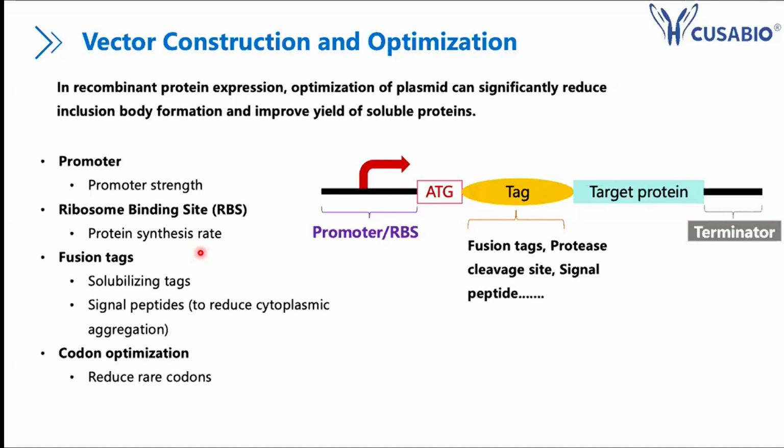And actually, these are the existing strategies for optimizing protein expression that people should choose. In this optimization, we can optimize the promoter, changing your promoter from a weaker to a stronger one. You can also do a simple codon optimization, make a smart choice of host cells, and optimize the culture conditions. All of these are included in the smart strategies to choose.